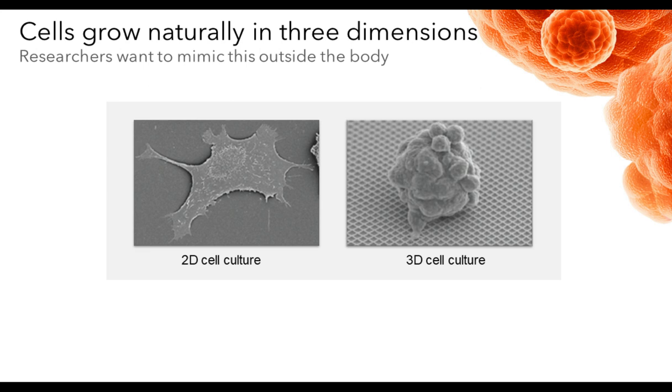Two things to note, one of which is the appearance of the cells looks very, very different, but of course the figure on the right starts to mimic how cells interact in the body. And in fact, if the structure on the right was a model of a tumor, for example, then these spheroid structures mimic very well many of the cellular associations one sees in cancer as well.